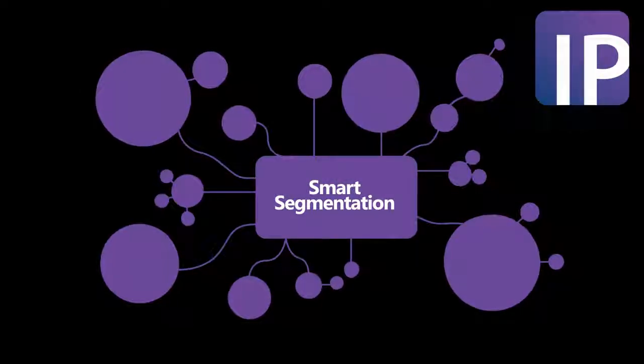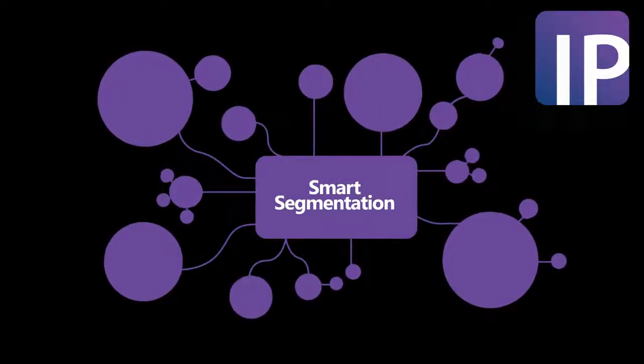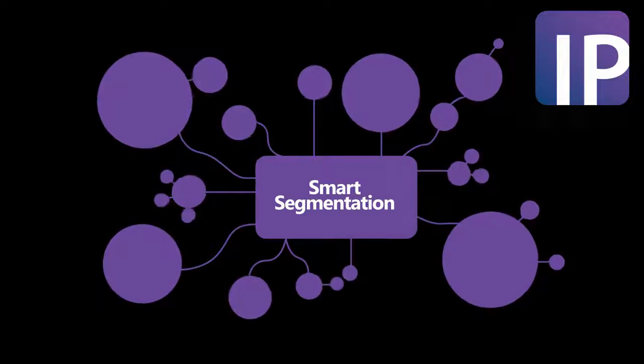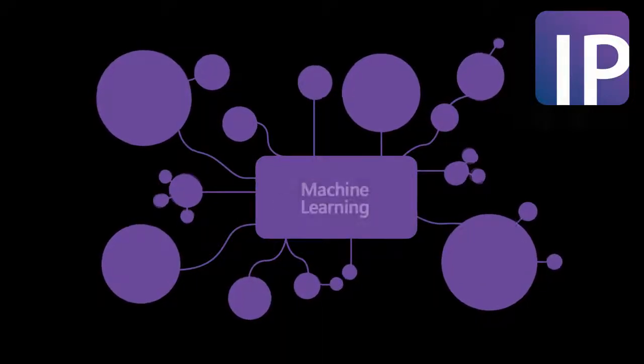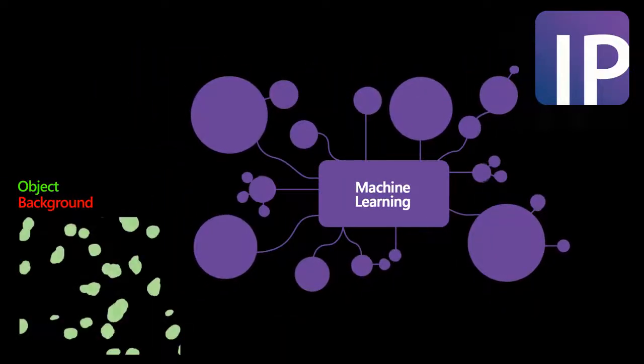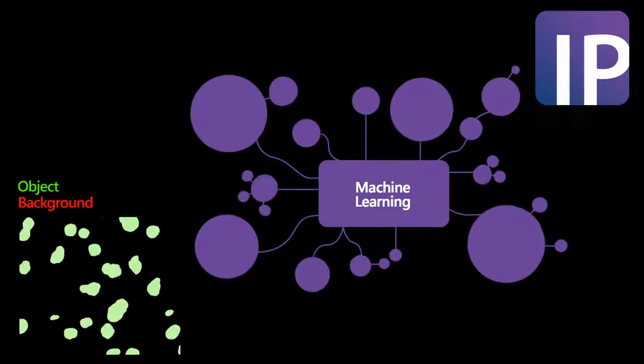Unlike other systems, ImagePro's Smart Segmentation empowers users to easily create personalized recipes for complex images. Users begin by isolating one or more reference objects using regions of interest.